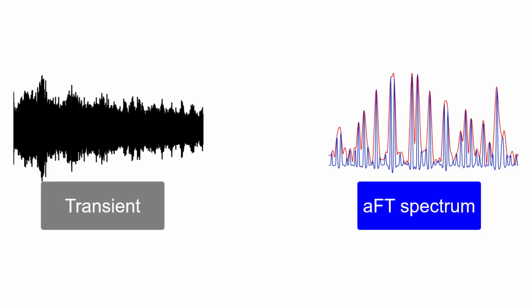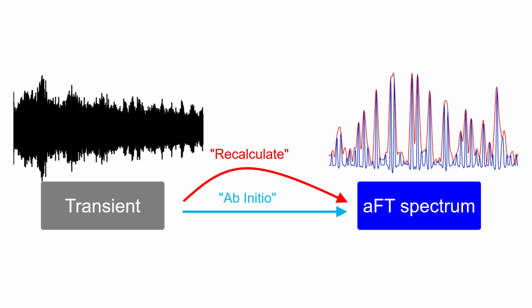The process of converting a Bruker ICR file into absorption mode is known as phase correction, or phasing. You can generate a phase correction function for a Bruker ICR file in 3 different ways in AutoVectis. In the first method, you can use information within the spectrum itself to generate its own phase correction function. Alternatively, you can use information that Bruker has saved into the file to generate a theoretical phase function. Or finally, you can apply a phase correction function that you've previously saved for this file or for a similar file. And in this video, I'll take you through all 3 options.